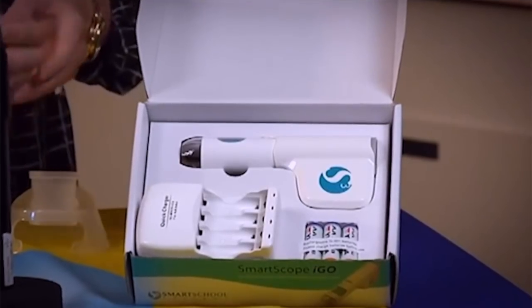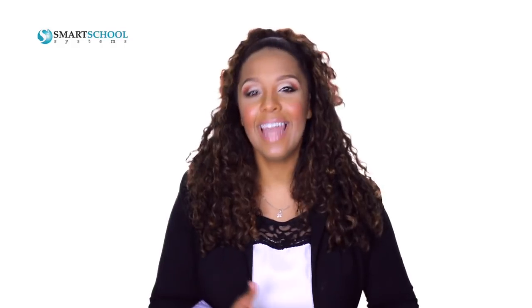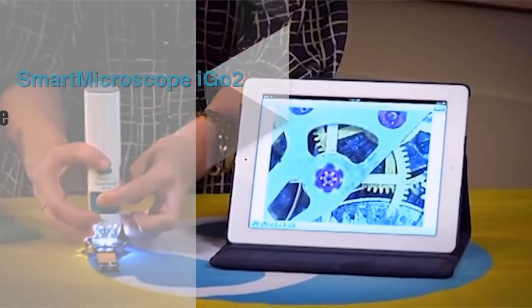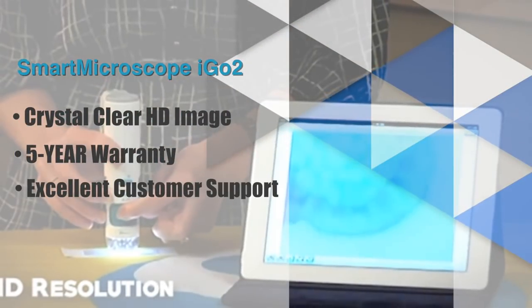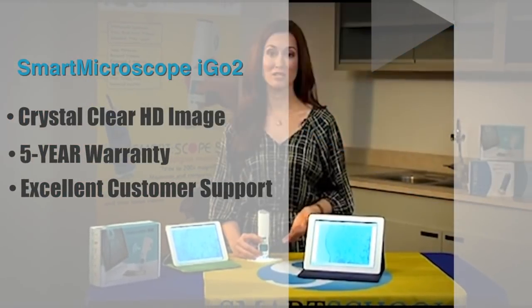Imagine how this breakthrough technology will transform your classroom experiences and ignite your students' interest in science to a level you never thought possible. With a crystal clear HD image, a 5-year warranty, and excellent customer support, the Smart Microscope iGo 2 is a no-brainer.